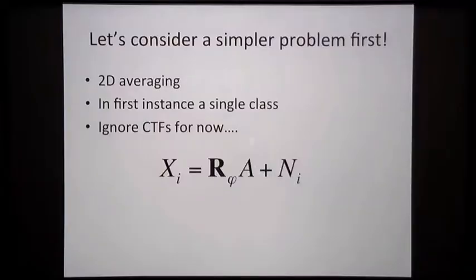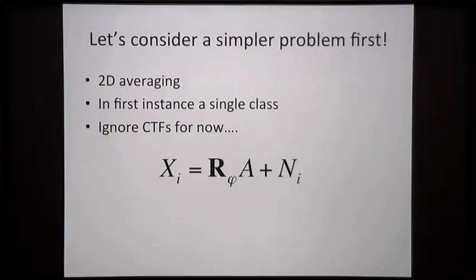Now, I thought just for illustration purposes to do a bit of a simpler problem first. So we don't have a three-dimensional model where we have a projection in a given direction and CTF artifacts. Let's start with a two-dimensional image, okay? So perhaps you want to think of this as your protein adopting some preferred orientation, so you put it on the grid and you always see a top view, okay? So this is a noiseless top view, and because it's a two-dimensional image.